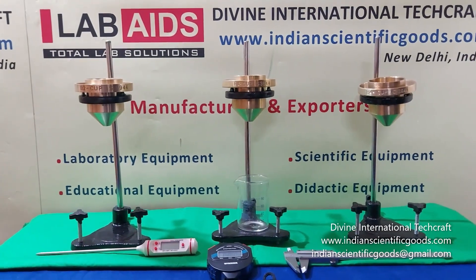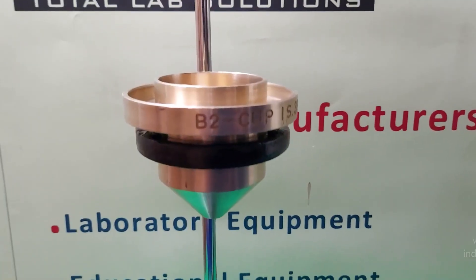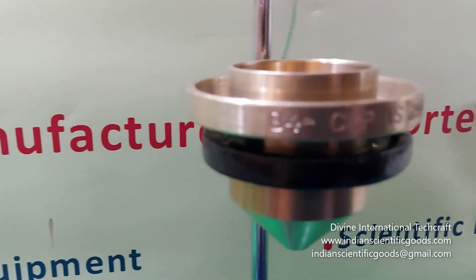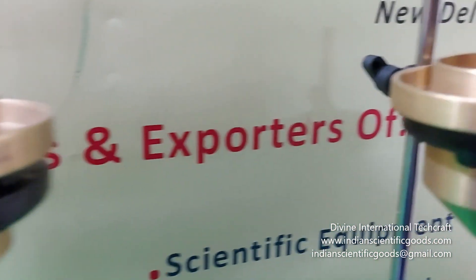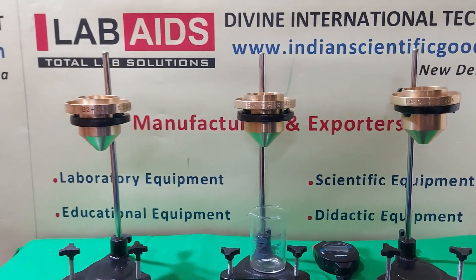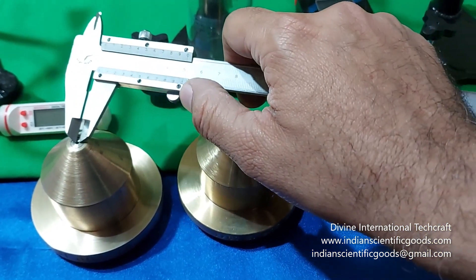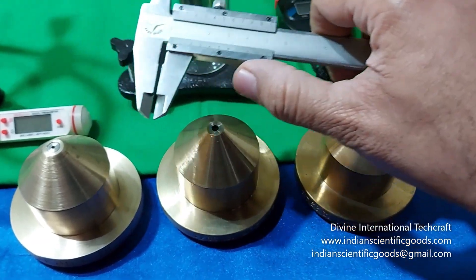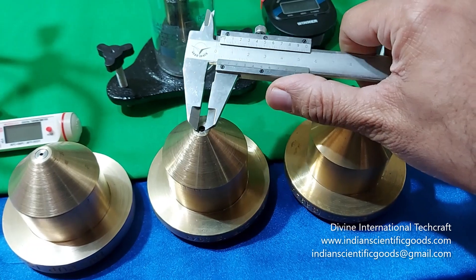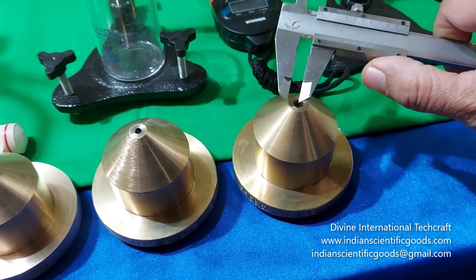They are used for paints, inks, varnishes, lacquers and other viscose products. On display here are Flow Cups of size B2, B4 and B6 as per the British Standard. Flow Cup B2 has an orifice diameter of 2.32 mm, Cup B4 has an orifice diameter of 3.97 mm, and Cup B6 has an orifice diameter of 7.14 mm.